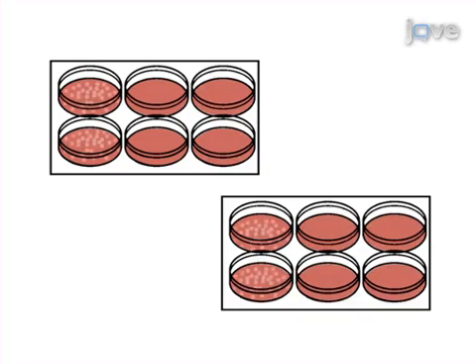Ultimately, the neutral red staining solution is aspirated carefully without removing the agarose overlay, and plaques are counted using a light box.